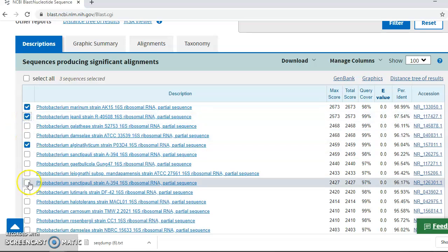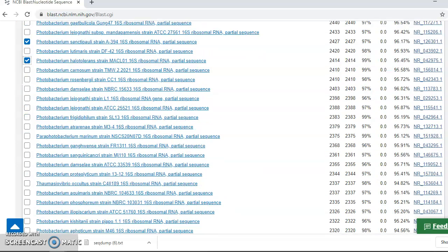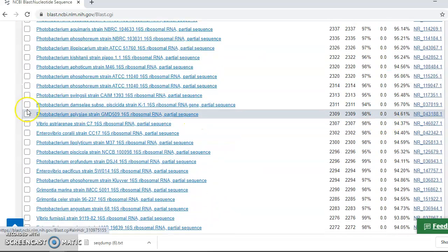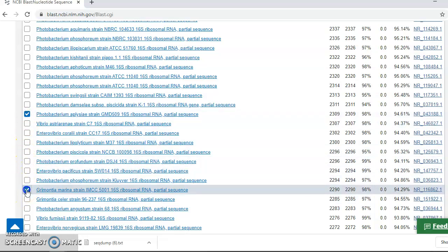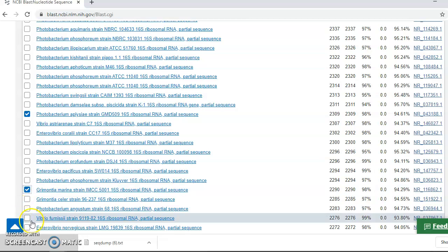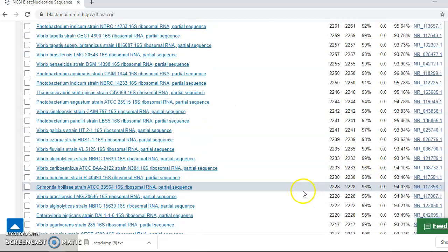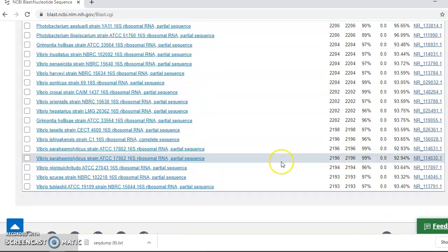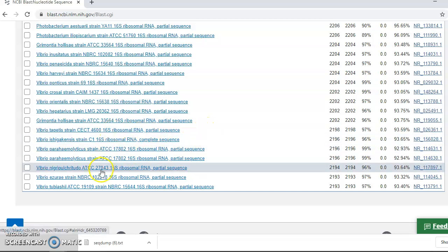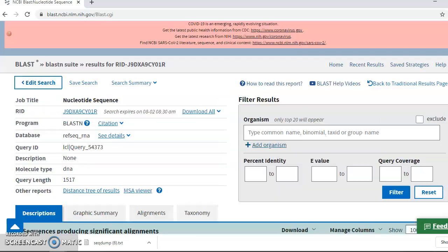Okay, 6, so we must choose 10. 3, 4, 5, 5, 6, 7, 8, 9, 10. Choose this one. Okay, now I already have 10.